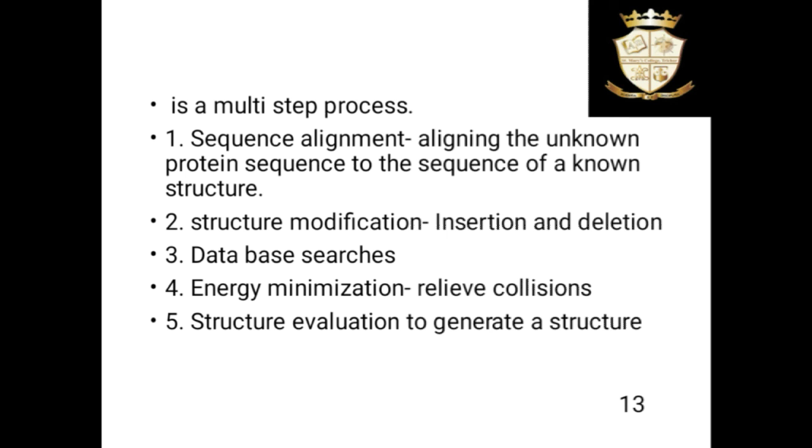And the database searches. And energy minimization, refining the model using energy minimization to relieve the collisions or steric strains. And finally, the structure evaluation to generate a structure, checking the validity of the modeling using visual inspection and getting the image.